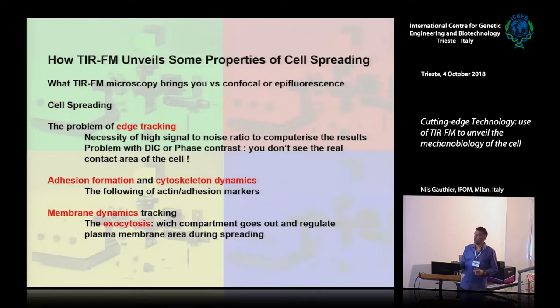Then you can also study membrane dynamics. And as Kumar presented to you yesterday with this exocytosis potential of VAMP and so on, you can do that in the spreading. And now you follow that, one of the best ways to follow exocytosis is to use TIRF.